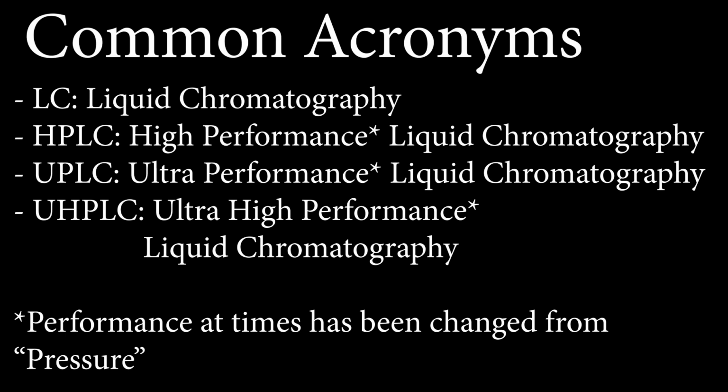So there are some confusing acronyms and definitions associated with liquid chromatography. LC is going to be liquid chromatography. Anytime you have a solid stationary phase, it's usually going to be silica based, and you are flowing liquid over it to elute compounds, you're loading onto the stationary phase and have a liquid mobile phase, you are doing liquid chromatography.